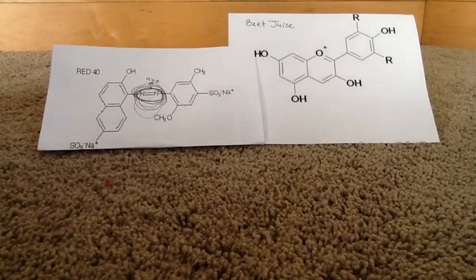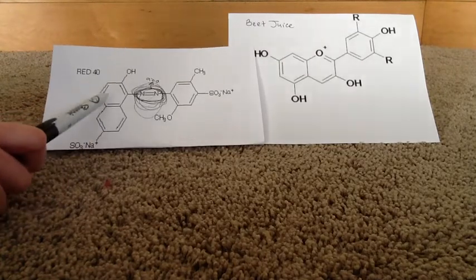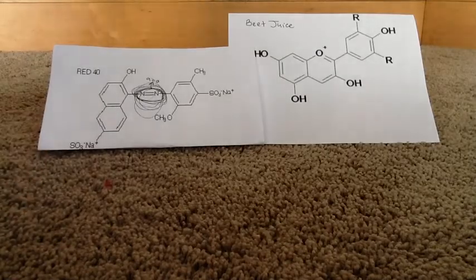It is stated by Terrific Science Press that red cabbage changes from purple to bright pinkish red as acidic vinegar dressing is added, and red has the longest wavelength, so most absorption. With such information, the red 40 dye would likely have a higher max absorption than the natural dye due to the azo bond with the multiple double bonds at the lowest pH sample.